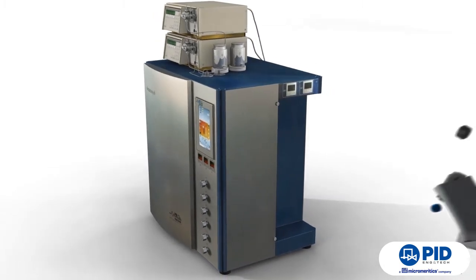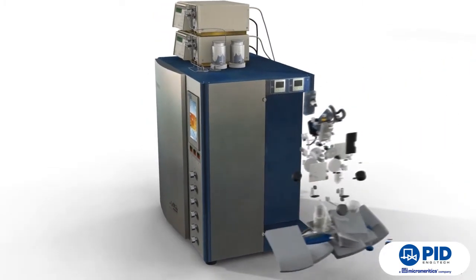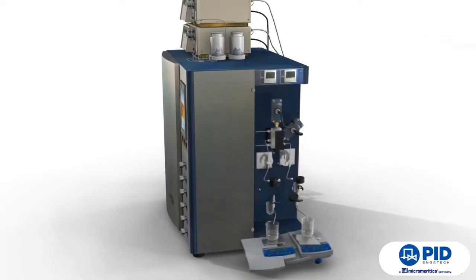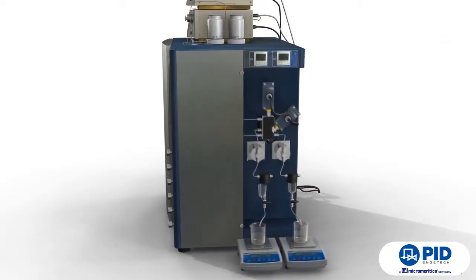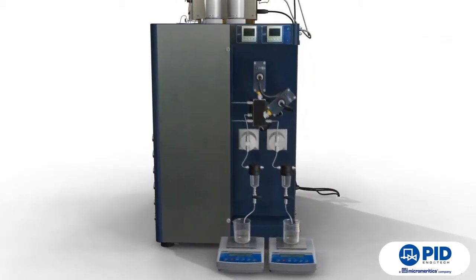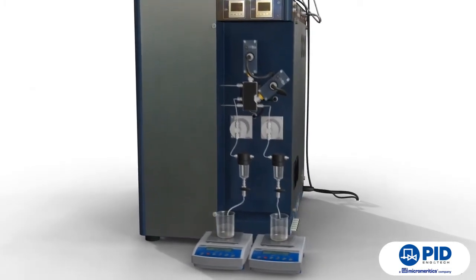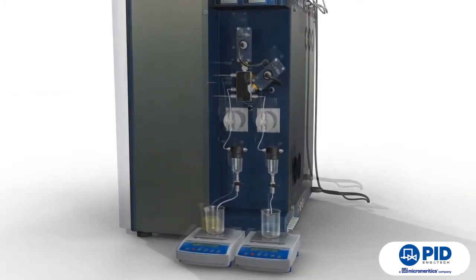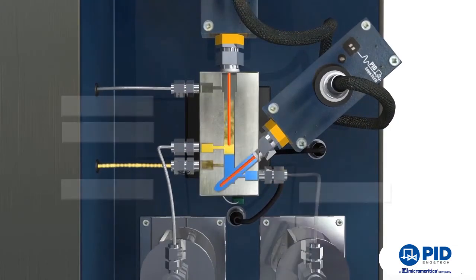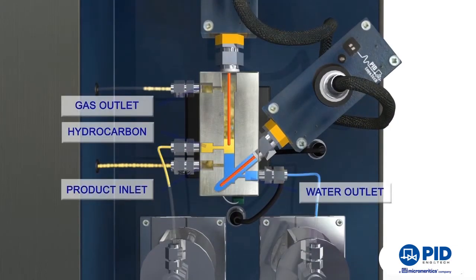The L2 of modular construction can be easily added to the microactivity reactor. It consists of a low-volume vessel whose temperature is achieved by thermoelectric effect thanks to the Peltier cell. Instead of a differential pressure measuring system, which is not feasible for micro-volume systems, it is equipped with two of our patented capacity level sensors, which have a linear response to the dielectric constant of the liquid.